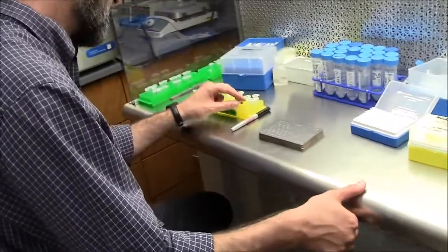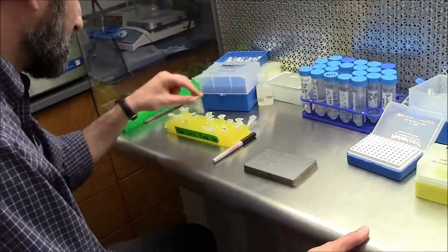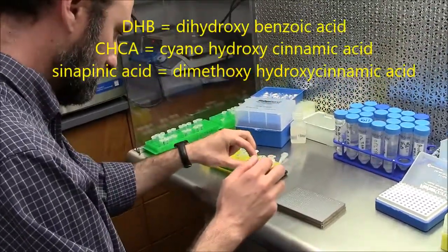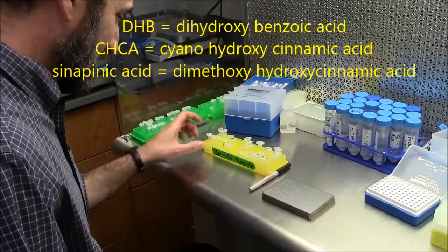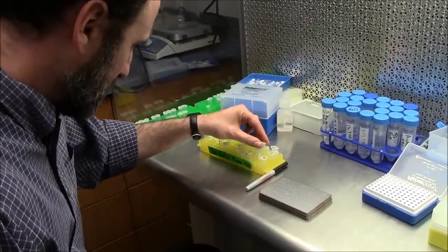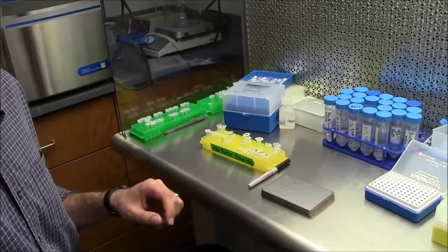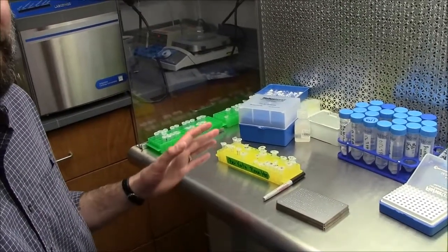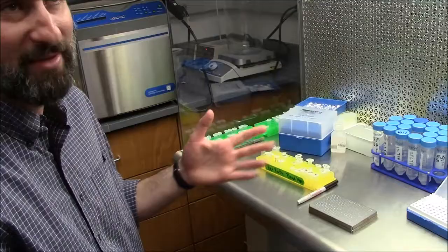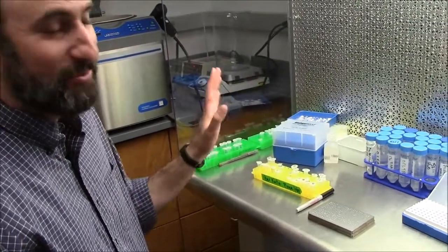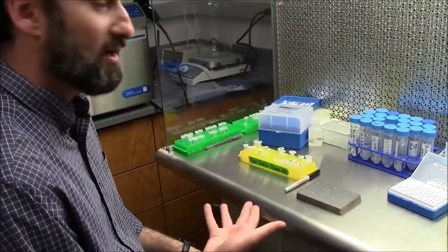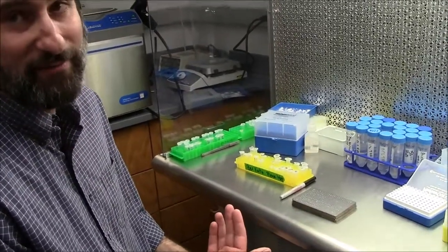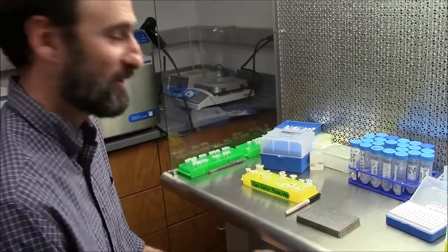Right now we have DHB matrix, we have CHCA matrix, and we have sinapinic acid matrix. They get sometimes kind of junky because these are our open access matrices that everybody uses. So if it looks like it's giving you problems, then I can make up some fresh stuff. But we run an open access facility, so people come and use stuff all the time. And you only need a half a microliter of matrix, so it's kind of silly for everyone to make up their own matrix.